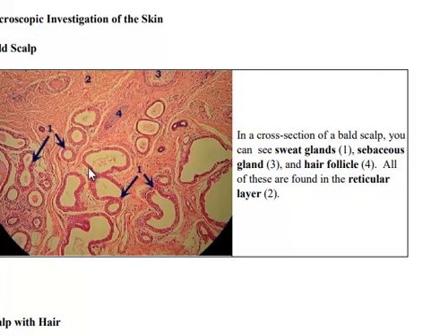So all of these that are hollow are the sweat glands. And this happens to be a bald person, so they don't actually have full hairs like you and I have. They're going to have a little bit of a follicle there, and they're going to maybe have a little wispy fine hair there. So this is the hair follicle of a bald person right there.